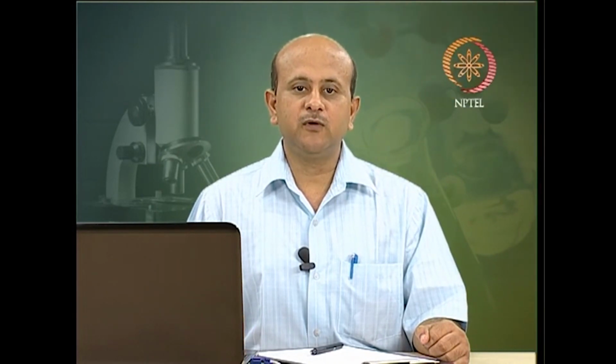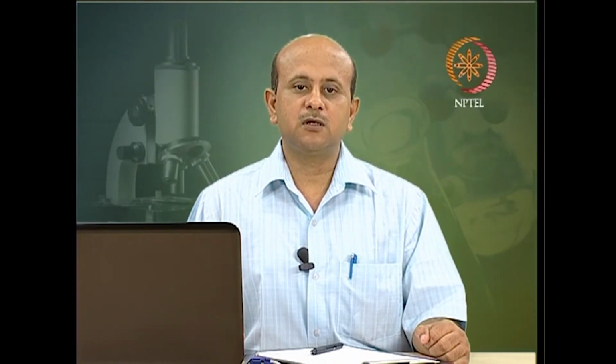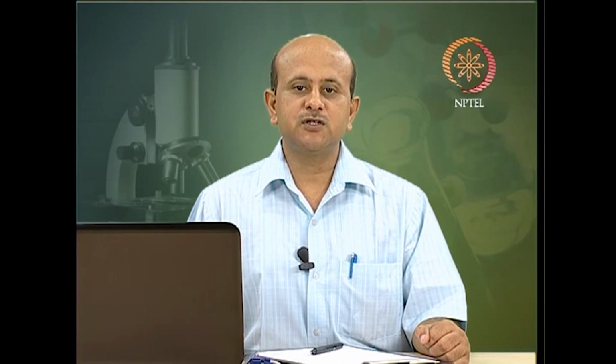Now, if you can recall, in the previous lecture we were talking about infrared spectroscopy, which to a certain extent helps in providing structural information. But circular dichroism has a lot of different parameters that could be used, and a lot of different conditions you can work around and get a lot of useful information.